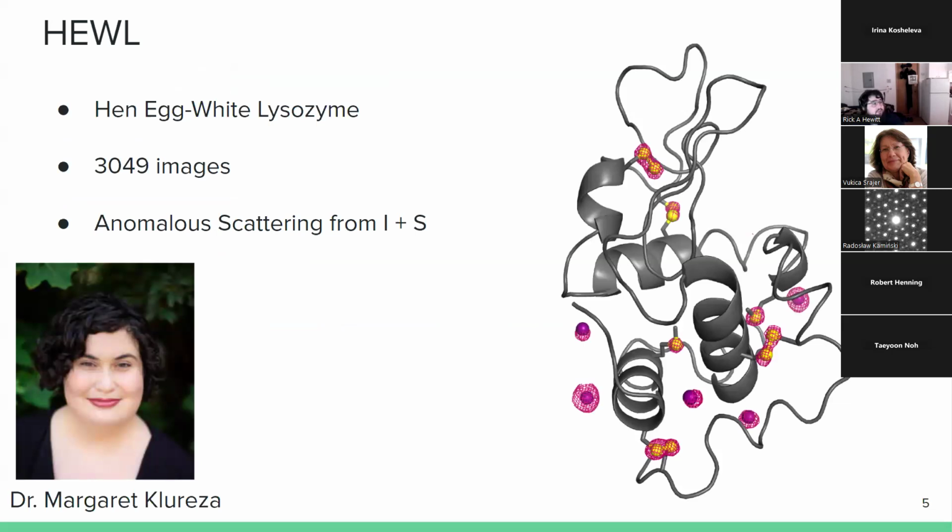First, I'll give a couple of illustrations of data sets we've been able to successfully analyze using Laue-DIALS. Some of these will also be shown in the paper. For versioning context, these examples use DIALS 3.17 and Laue-DIALS version 0.4. That is the version in the paper and in the data depositions associated with the paper, so you can reproduce these using that if you like. Currently, DIALS, I think, is on version 3.22, so we're working on updating compatibility with that.